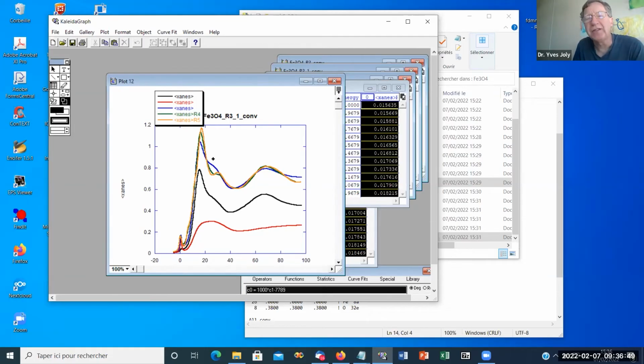And the most often, what happens is, in fact, in the structure. So you must absolutely check that. If it's completely, very, very different, there is a problem. After, if you want to fit perfectly the pre-edge and so on, okay, it's hard. Very often, the position of the pre-edge is not perfect. In the simulation, rather often it's at a bit too high energy versus the main edge. So there are some difficulties sometimes. But roughly speaking, it must be convenient.